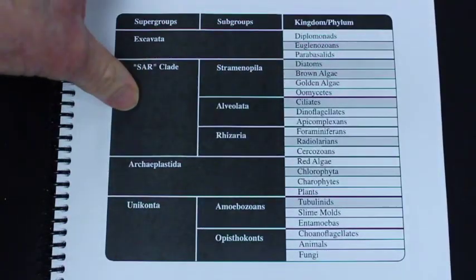So for the study of diatoms, I have a very cool slide here. So here's our slide. This slide was specially made by Josh Stepanek, a PhD student who specialized in diatoms. He went to University Pond, which is right here on campus, went in, grabbed a sample then, and cleaned up the sample and made it so that we could visualize these diatoms really well. So these slides you won't be able to find anywhere else, and really these slides are higher quality than any slides I can get from any other company.